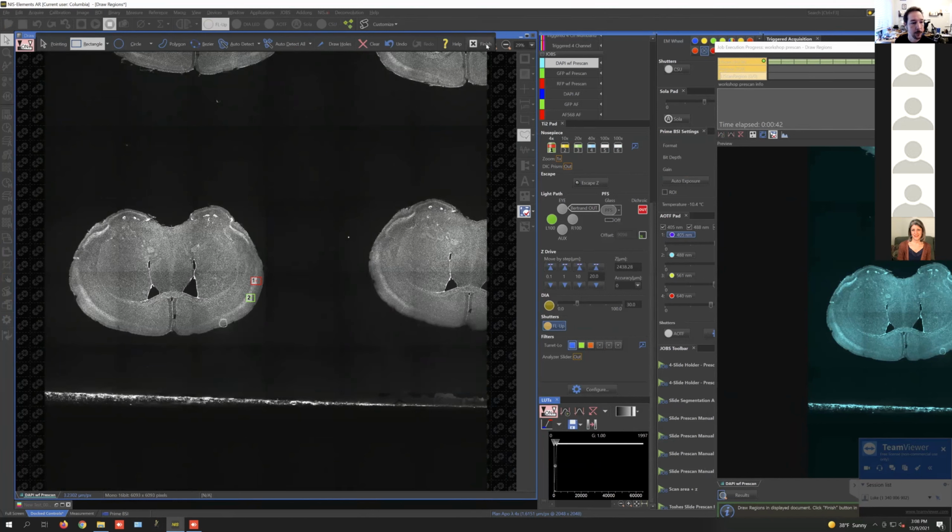Before I do, we were talking before about using this deep learning tool for detecting the tissue, but the way that it's trained, it can also be quite good at detecting features that have a different texture or are visually different to surrounding areas.